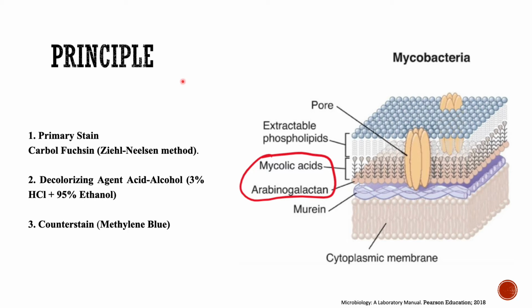For the acid-fast stain, for example, we have a smear of sputum. It is covered with the red stain carbolfuchsin, the primary or first stain, and heated to aid dye penetration. With the heat, the stain will penetrate the wall, the thick layer of lipid.